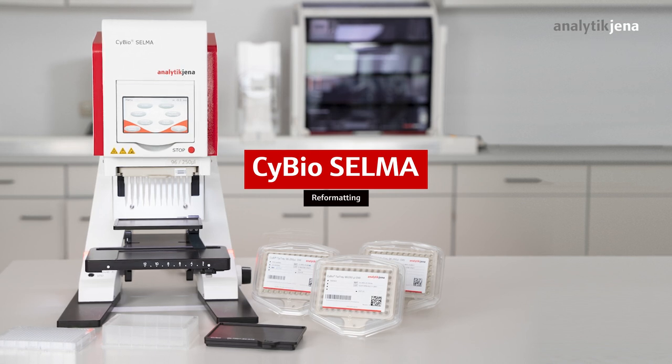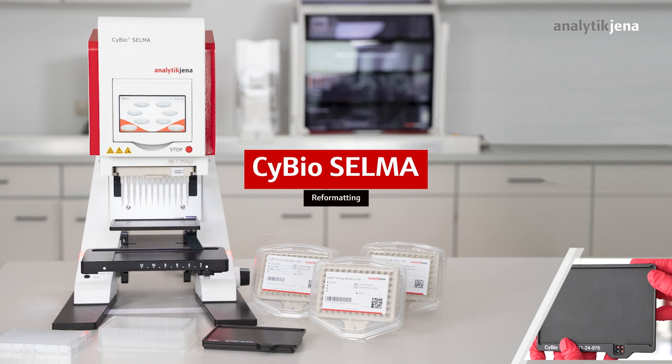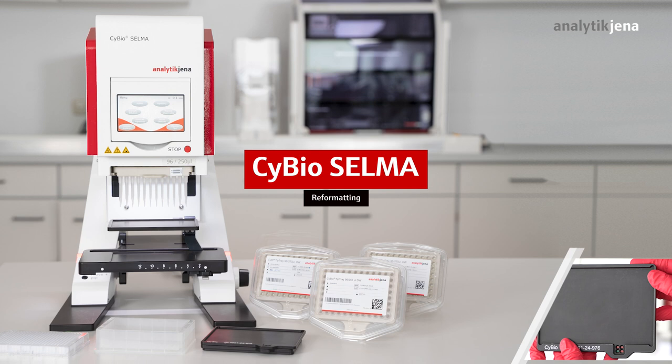This tutorial shows how to easily perform a reformatting using the pipetting mode, repeat dispensing, and the microplate adapter 384. This adapter allows safe and reproducible transfers from a 96-well microplate to the four quadrants of a 384-well microplate.